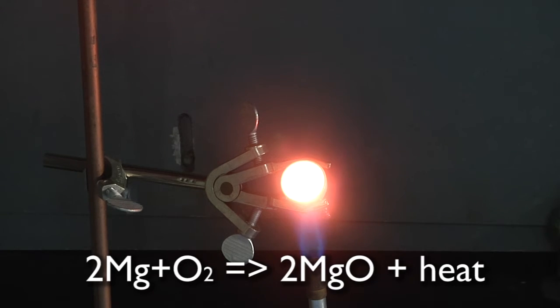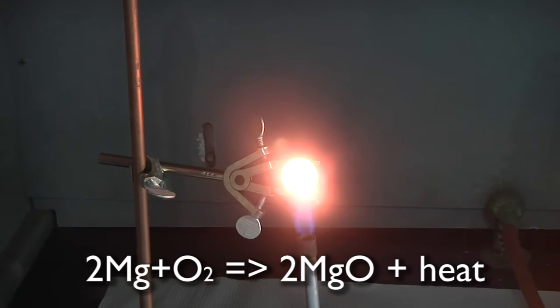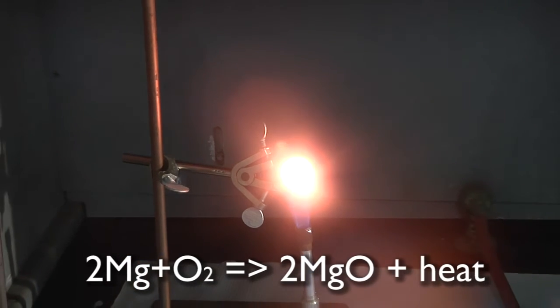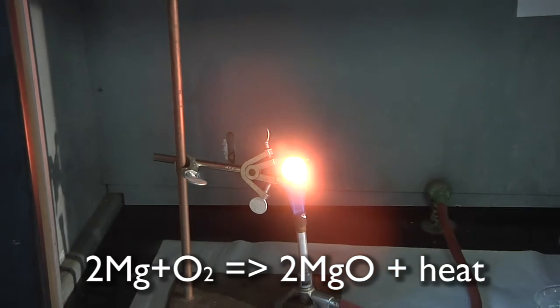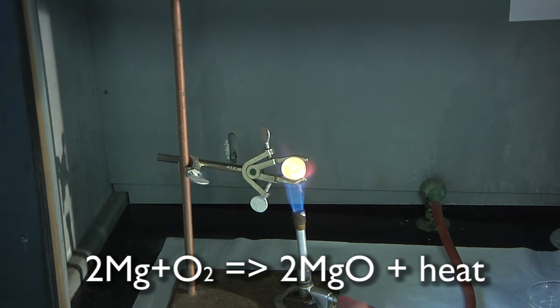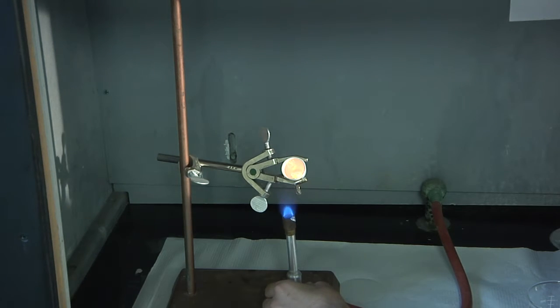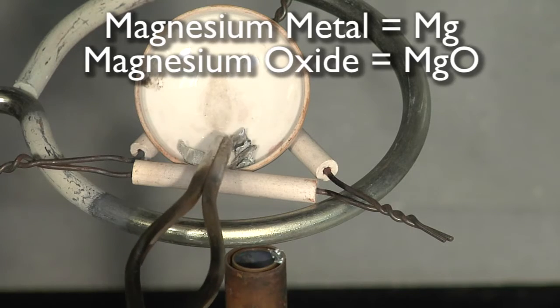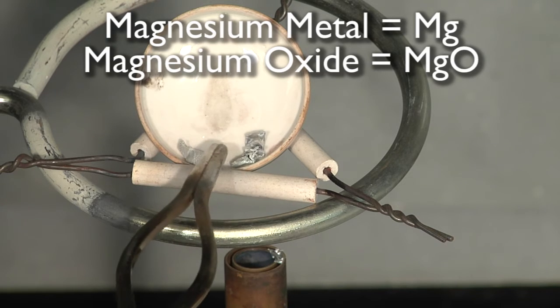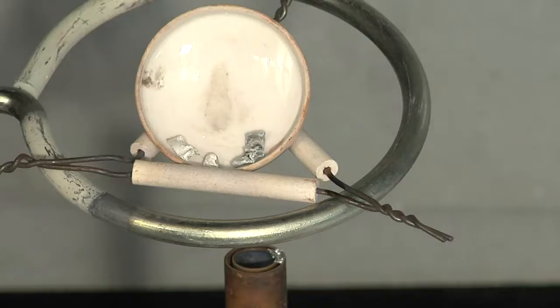If it ignites, don't look directly at the light. Once oxidized, the magnesium metal changes color to a much duller gray, like when iron rusts. Allow to cool and weigh.